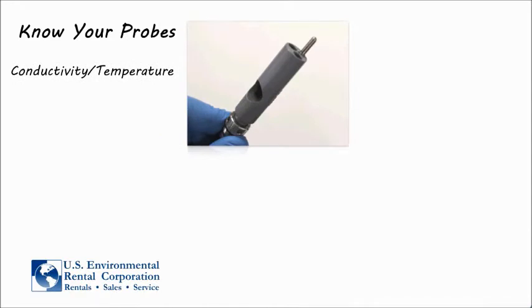Here we see a combination conductivity and temperature probe. Make a note that the conductivity vent hole is located on the side of the probe, not at the bottom.